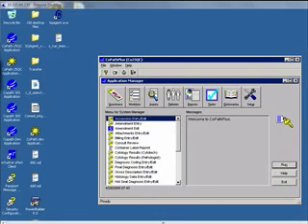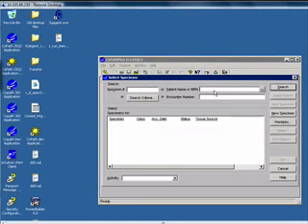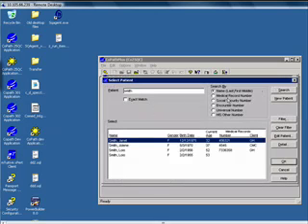What I'm going to be showing you today is how a pathologist will use CoPath and the mTuitive xPert system to complete a synoptic report. Let's begin by searching for a patient by name. Here's the patient we're looking for.